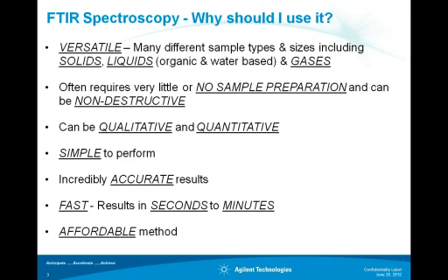So why would you be using FTIR? Why should I use it? Well, FTIR is one of these workhorse analytical methods. This is how I put it: virtually all labs have one and probably need one if they don't have one. And the key to this is the versatility. It can virtually measure any sample type or size or form, from solids, including your powders, pellets, solid blocks, or even your finger, liquids, from organics to aqueous-based samples, and gases.